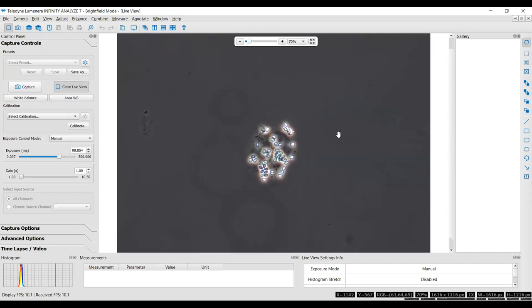And then I'm also scanning at a larger power, going across the slide at a larger power. So if there are larger colonies, I find them. If I find one at 400 and I find two at 100, I change my magnification to 100, because it overestimates the density to count it at 400 for the colony. So thank you. Is that what you guys do too?